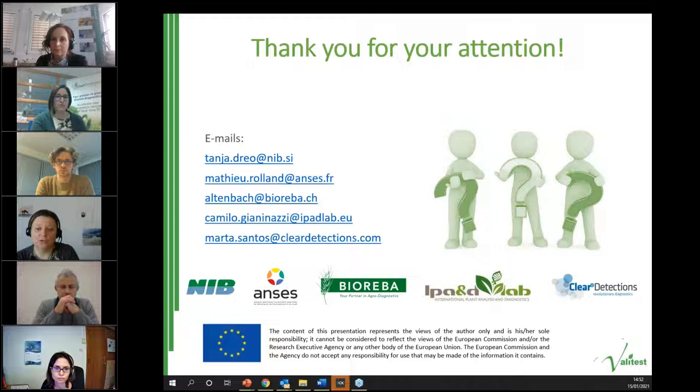One is to prepare a reference material in a very standardized way and characterize it to the extent where you can be almost absolutely sure that it behaves in exactly the same manner as the material that we use now. For example, by additionally quantifying the targets with digital PCR, or alternatively include a small experiment comparing the new test that you may want to validate to more extent with the previous test on a selection of samples. So that would be then verification against an older test.